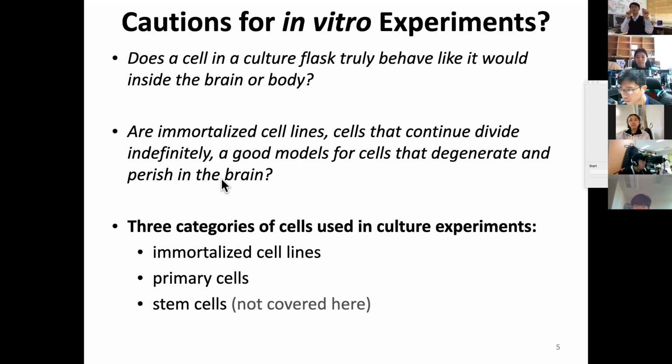So we use one or two cell lines to run experiments. And then, hey, we found a good compound that can kill breast cancer specifically. But then the conclusion has to be very, very careful, because this cell line is coming from one single individual cancer patient.